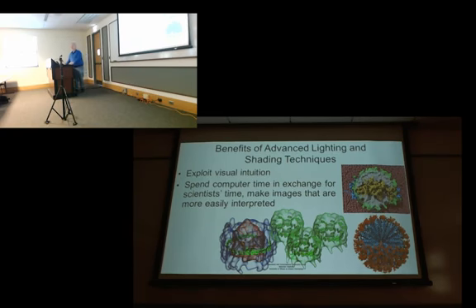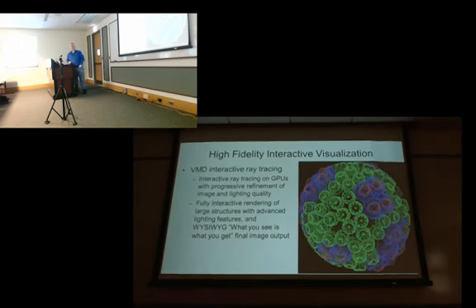So do you think, for example, for the large image that you showed afterwards, that would be possible to do with a regular computer, or do you need something more? Oh yeah, this is definitely possible to do with a regular computer. I did do it with a regular computer, just a PC. Okay. This doesn't require a supercomputer.